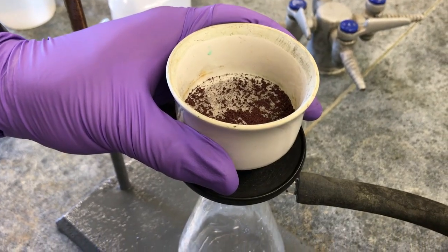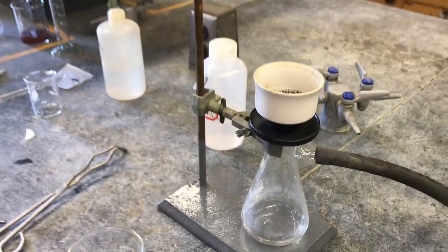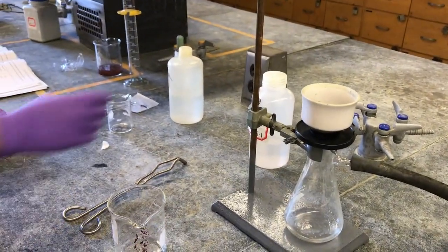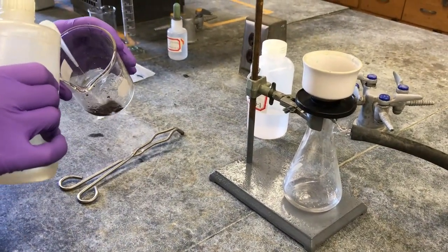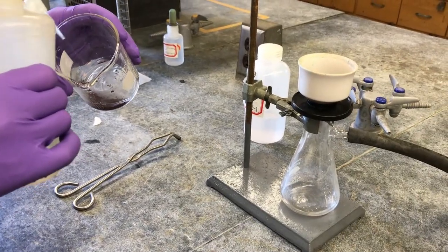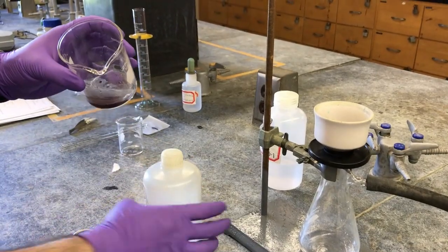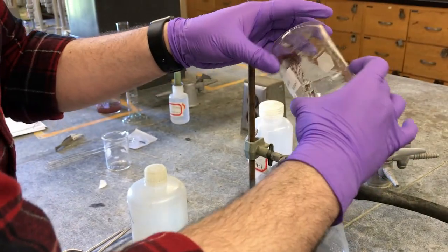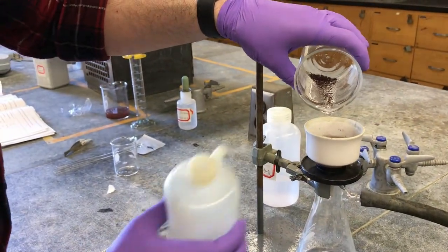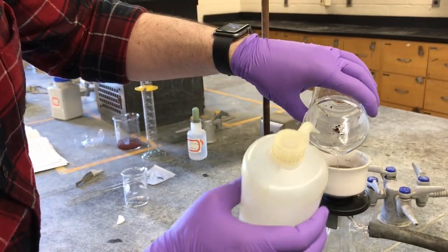So you can see that a lot of the water has disappeared from the top. It is filtered on through into the bottom. So what we're going to keep doing is adding a little bit of water to here, and just continuously dump it. One thing we could do is squirt this and allow it to fall.